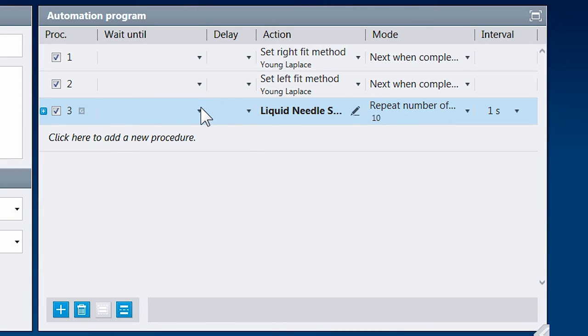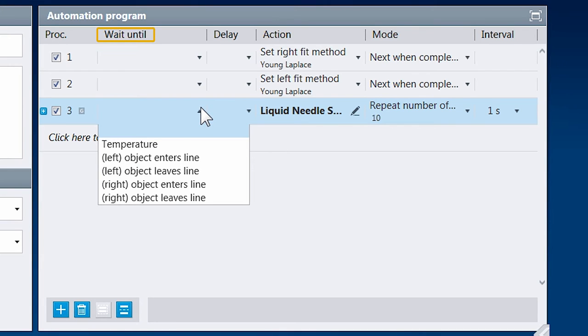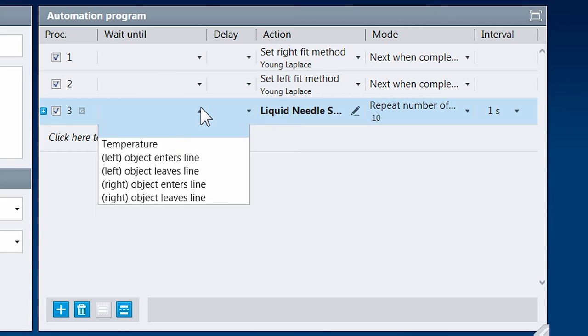Furthermore, you can make the action wait until a specified event occurs before it starts—for example, until a certain temperature has been detected. Wait until can also be used as a stop condition, triggering the end of an action or of a repetition. But we don't need to add anything here.